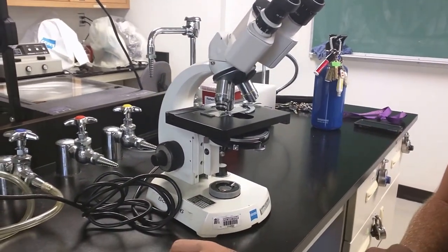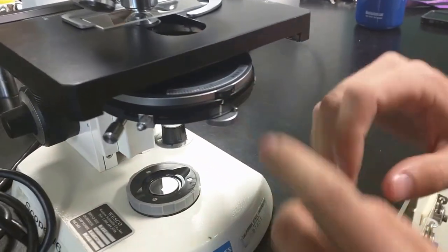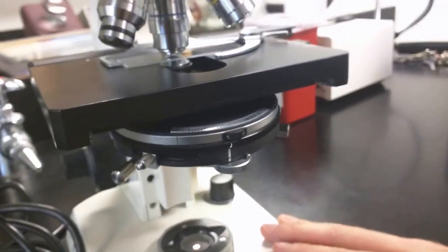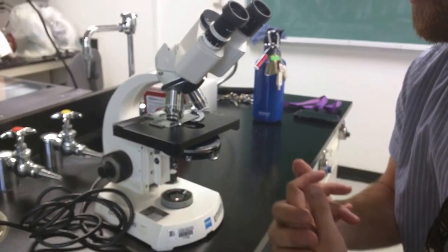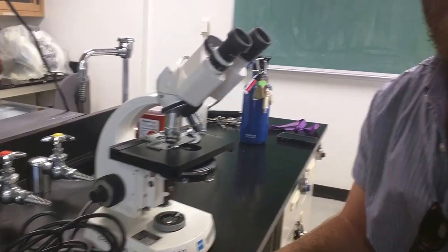So this is a video for Köhler illumination. Real quick, something I forgot to mention is make sure you're on J. That's for bright field. This is Köhler illumination for these scopes in 4209. And yeah, we will do another video for phase ring alignment. But for the most part, this is what you need to do to align your scope.